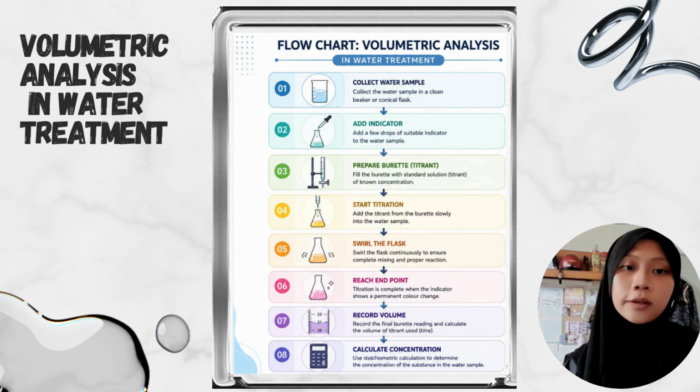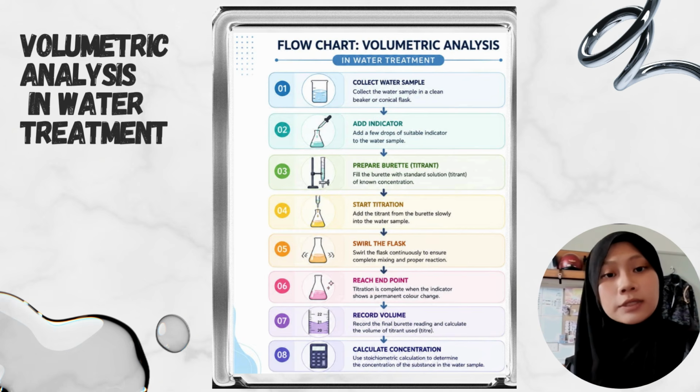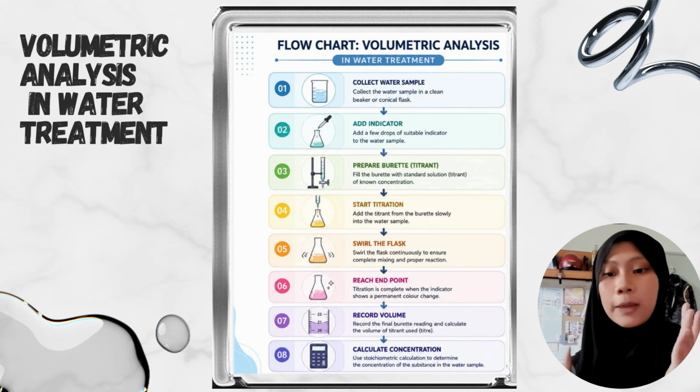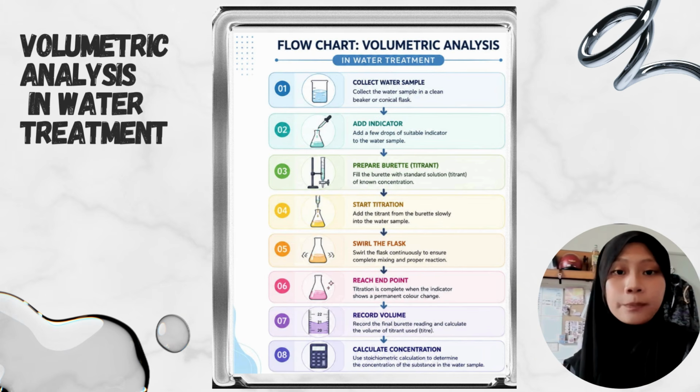Fourth, start the titration. Add the titrant from the burette slowly into the water sample. Remember, do not run the burette faster because it can change your data. Fifth, we need to swirl the flask continuously to ensure complete mixing. And sixth, reach the endpoint. Titration is complete when the indicator shows a permanent color change. As an example, my solution before the titrant is white. After the titration, we have a pink that is permanent. That shows you the titration is complete.